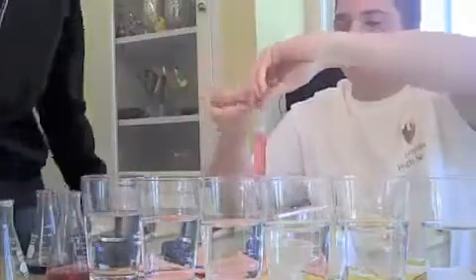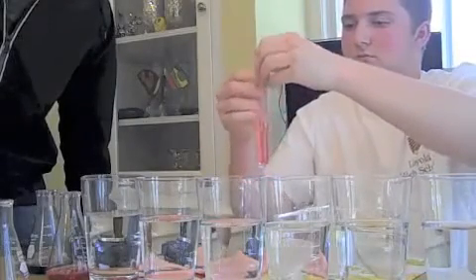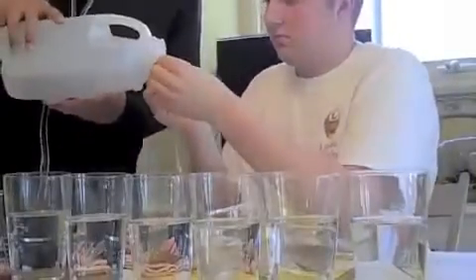Then, the top half is tied off tightly, but leaving a little room with no air bubbles in the bag for water to enter and expand. The same process is used for the remaining 5 solutions.